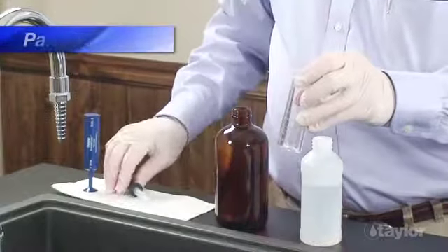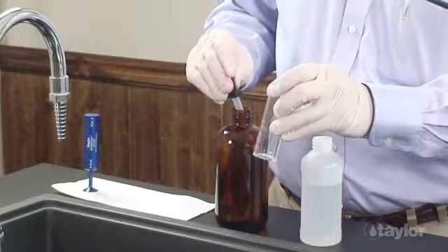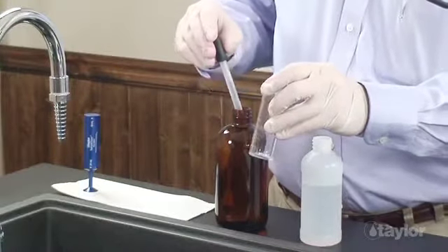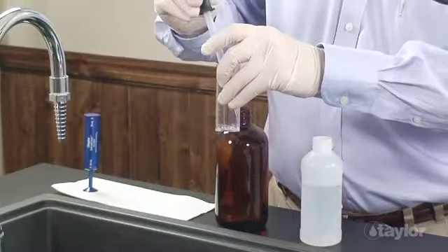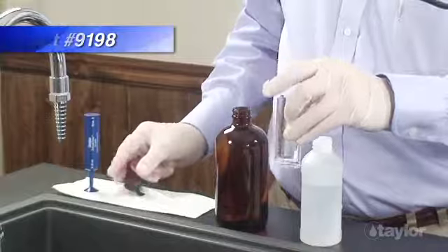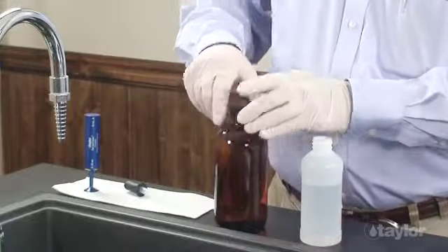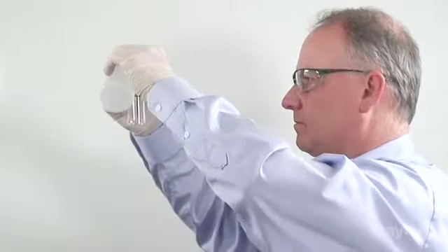Fill the 3 milliliter pipette to the 2.5 milliliter mark with the water to be tested. If the sample is turbid, it must be filtered before proceeding with the test. Place this water in the second 25 milliliter sample tube and dilute to the 25 milliliter mark with distilled, deionized, or molybdenum-free tap water.